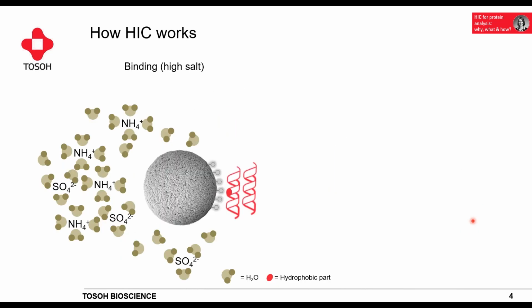Now, a very similar but, I would say, better visualized illustration of what happens for the binding of our molecules, in this case proteins, onto the stationary phase is shown here.